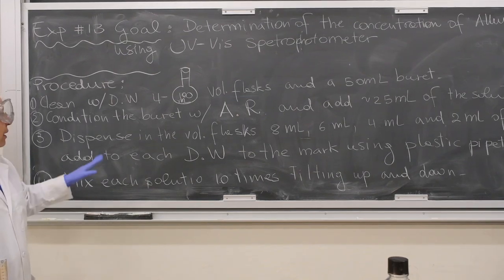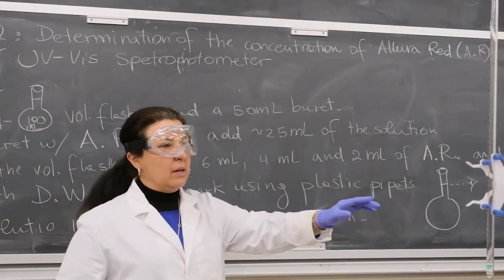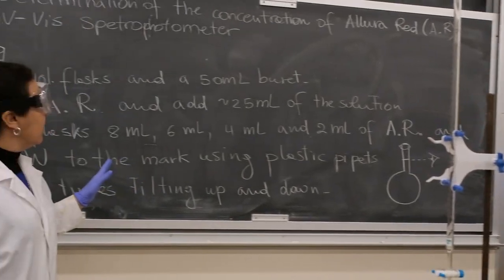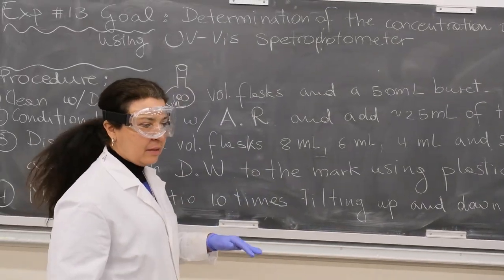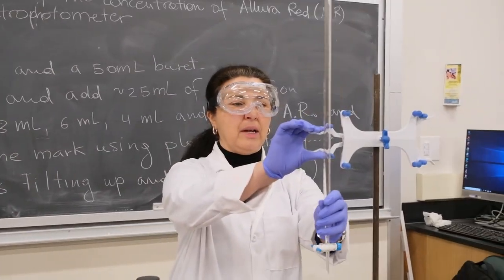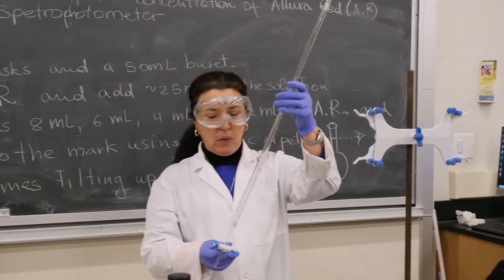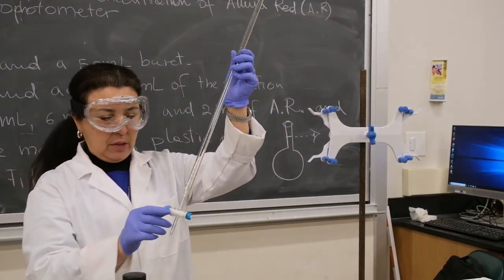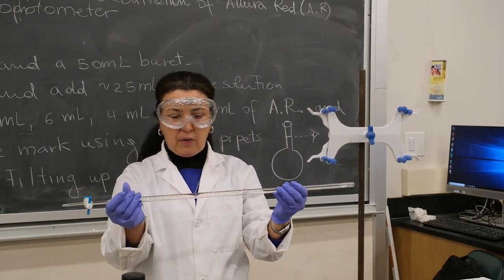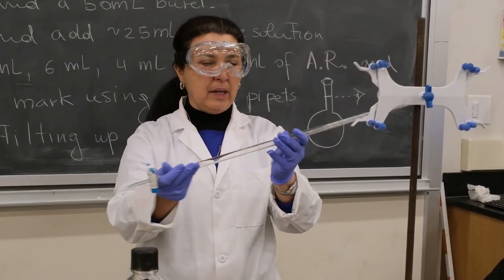We are going to clean four 100 milliliter volumetric flasks and one burette. So we usually clean with water and the deionized water. Once we've done that, we're going to condition the burette in the way we learned many times for the titration with the Allura Red, this solution. We'll let it go through the tip, then close it, and then rotate so that the Allura Red collects all the drops of water that we have in that burette.